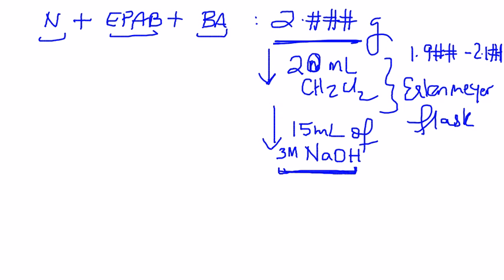Please read the label very carefully. If you add too much, you have to start all over again. Okay.